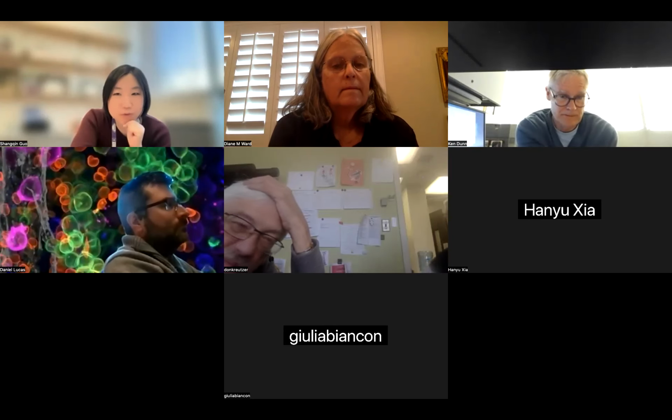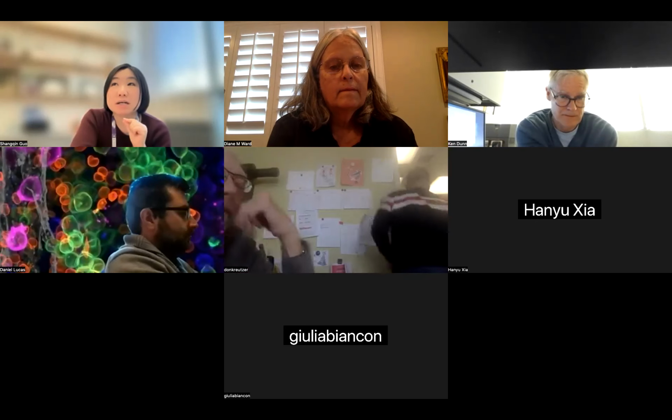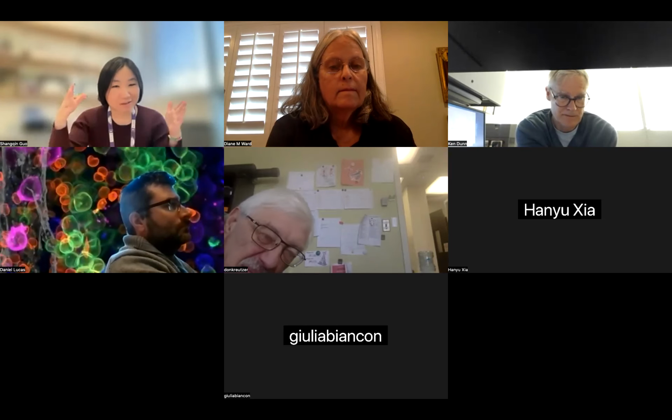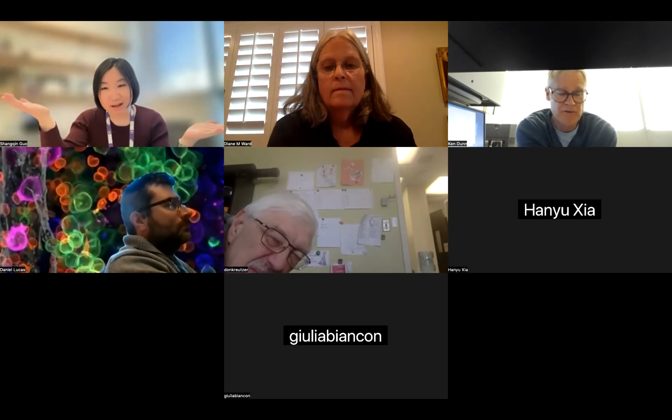It feels to me that to image such live transcription factor dynamics, light sheet microscopy would be the way to go.